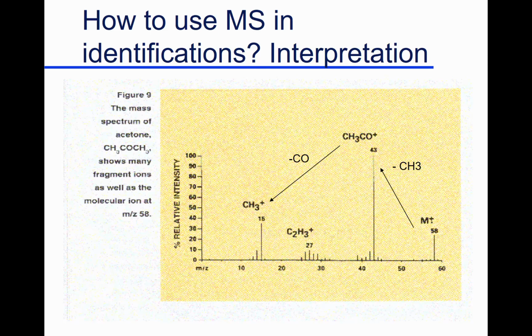So at the end I said, pardon me, sir, how can you have two forms of butanol? How can you have two identifications of that when they're separated? Your order typically is what comes out of a gas chromatograph, and it's impossible to have that order because they're separated in terms of volatility. He said, well, that's what the machine said. That's what the computer said, right? And that's the danger of it.